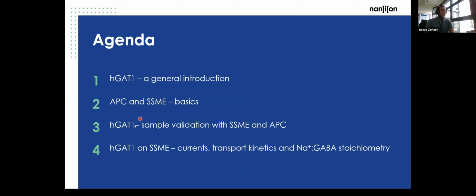Then we will see the validation of our sample using solid supported membrane electrophysiology and automated patch clamp. And in the end, I would like to share some data that hopefully gives some new insight into how the protein works.